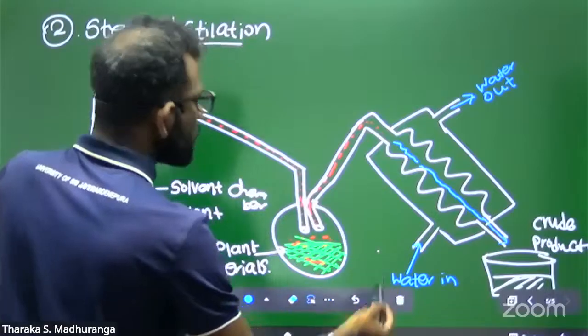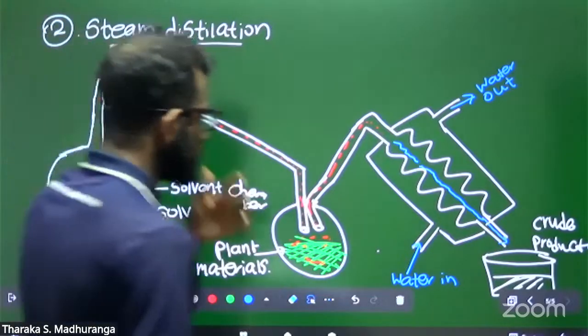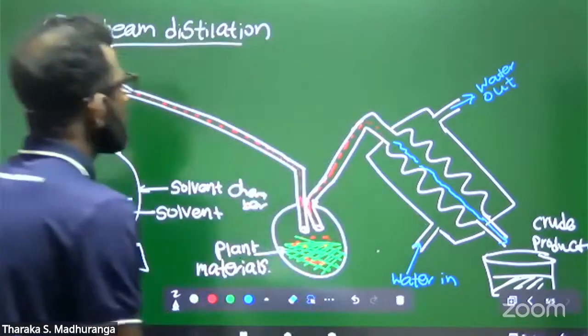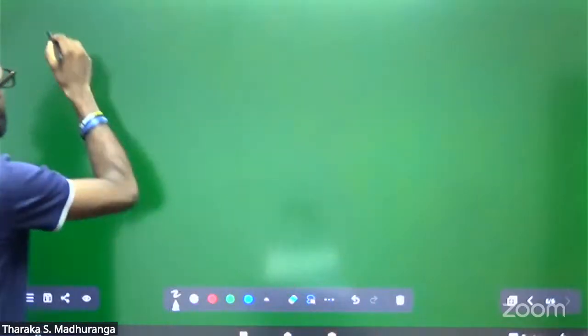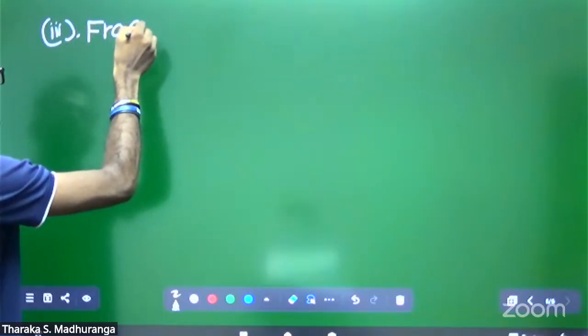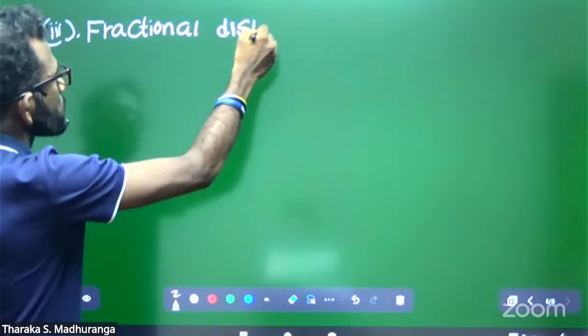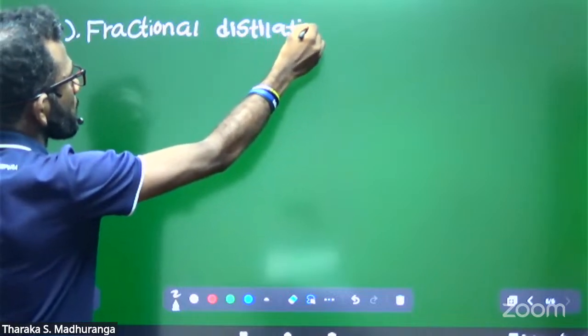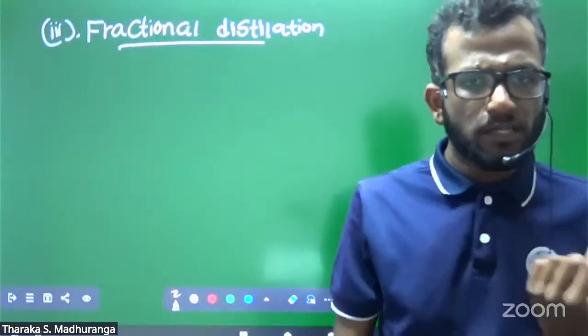Okay, come to the final one. The final distillation method. Fractional distillation. What's the meaning of fractional distillation?